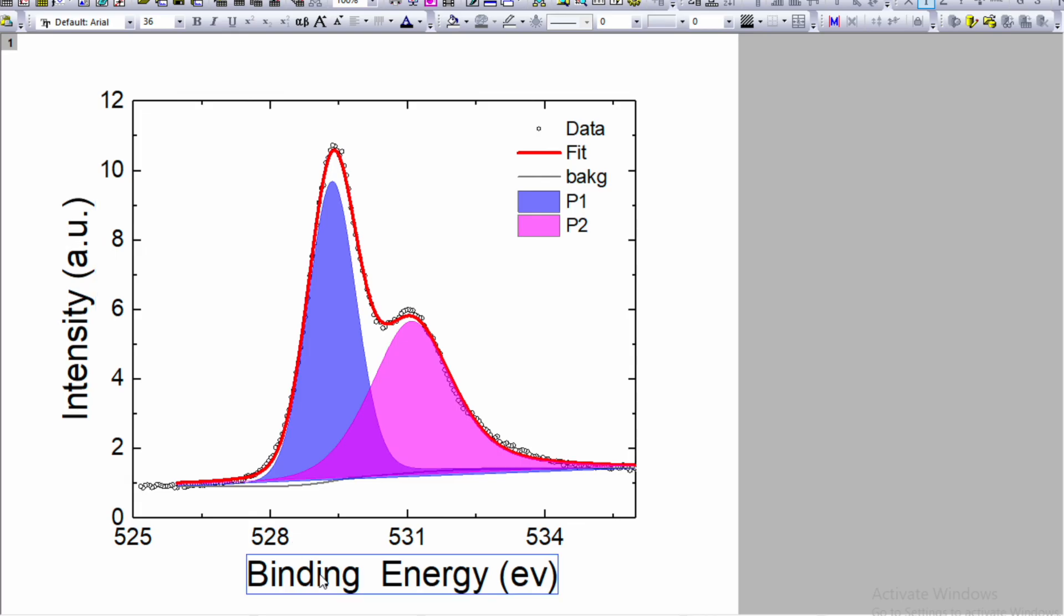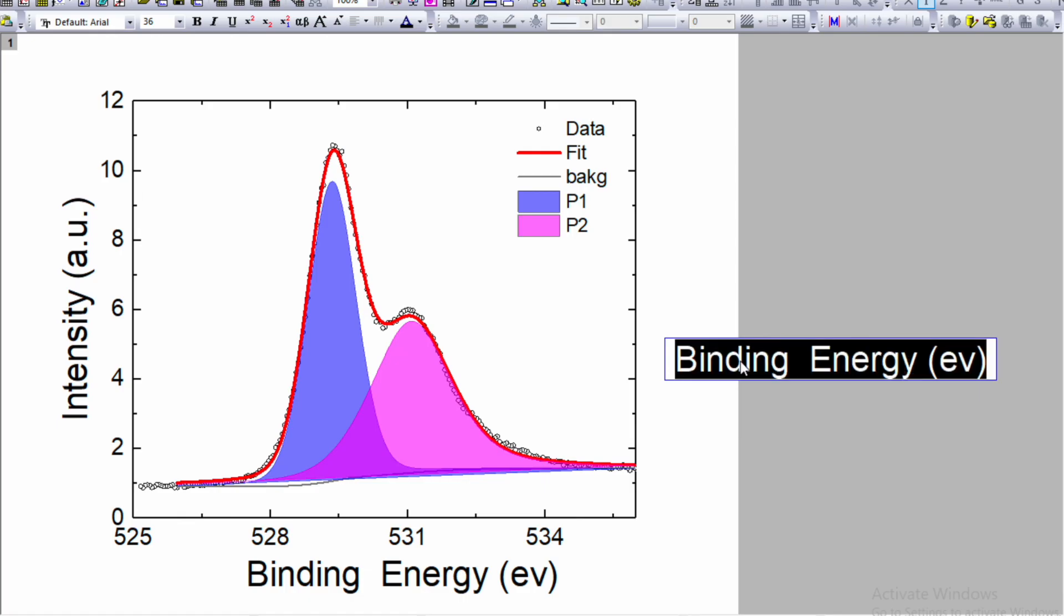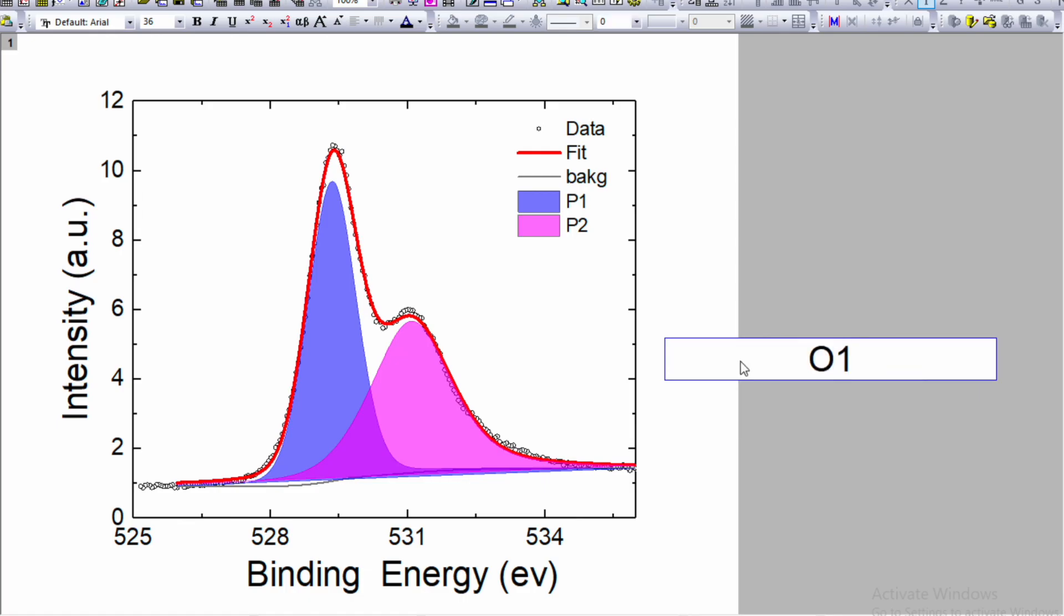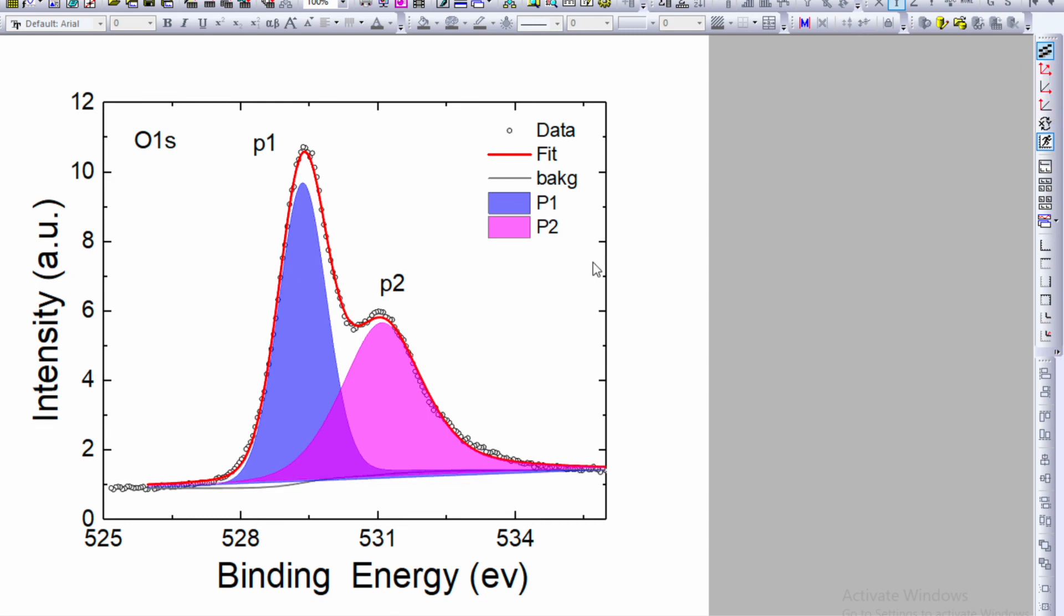Now if you want to add a text, either you can just copy, paste, and write down this is O1S. Right hand top corner you can see option: enable, disable anti-aliasing. Just click over here. It will help you to smooth out the data.